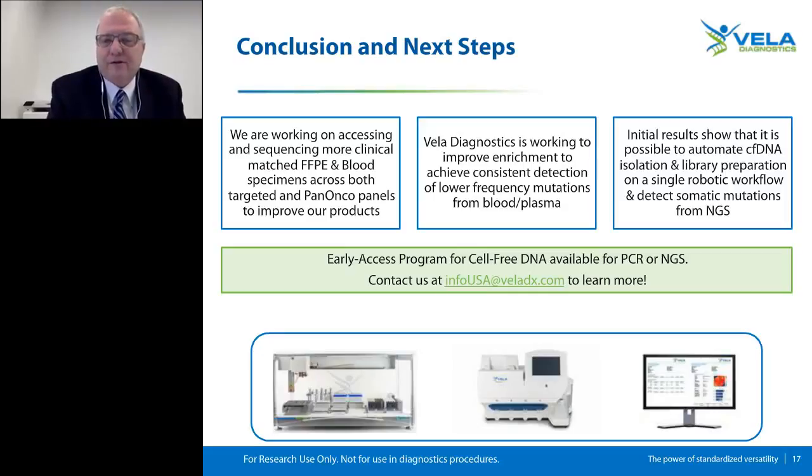From the initial results that I've shown, you can see that it's possible to automate cell-free DNA isolation and library preparation on a single robotic workflow and detect somatic mutations from NGS at a very low frequency with a very low sample input amount.